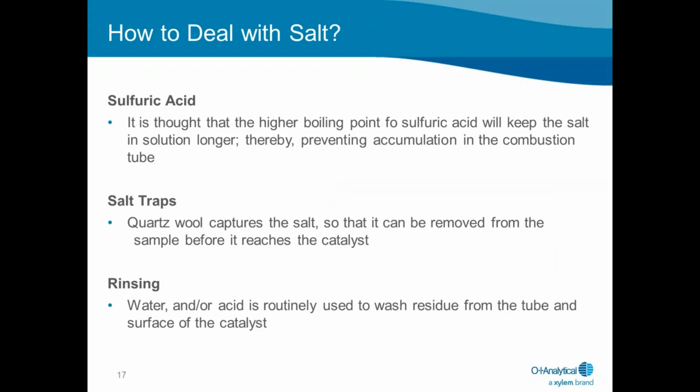So how do we deal with salt? There are a number of approaches that have been used to mitigate the effects of salt on the combustion system. Sulfuric acid. Now keep in mind, we're generally doing an NPOC technique in which we're going to use some form of acid to remove TIC prior to injection into the combustion tube. It is thought that potassium salts of sulfuric acid with higher melting point than sodium chloride have a positive effect on the lifetime of the combustion tube.